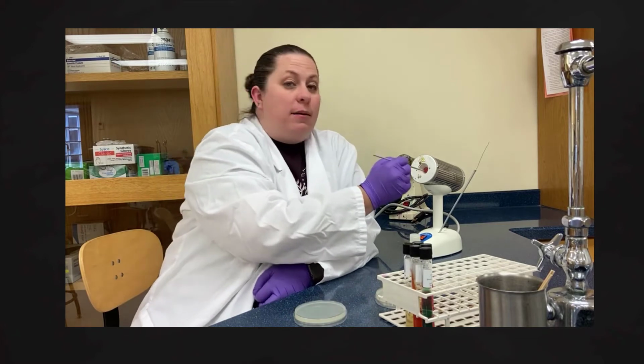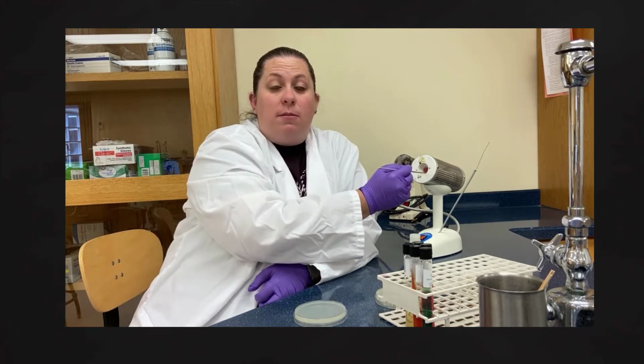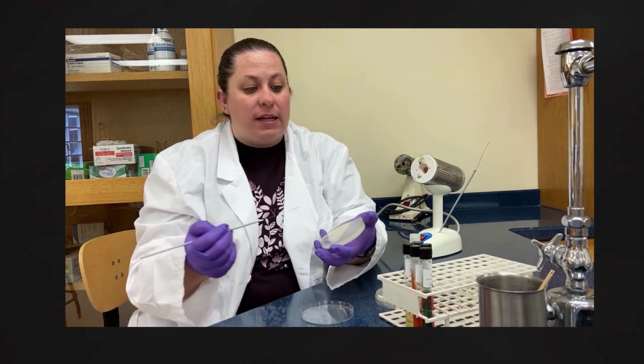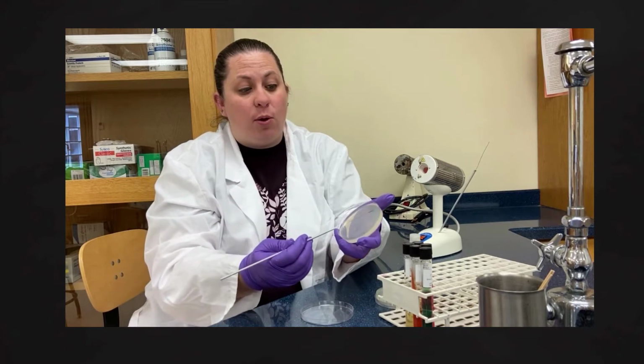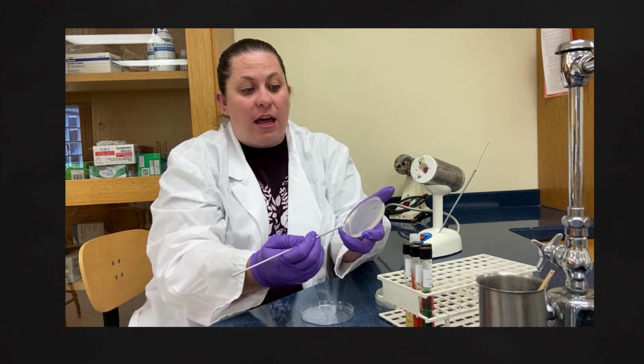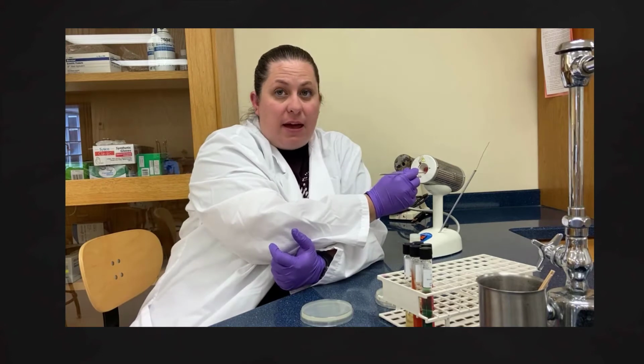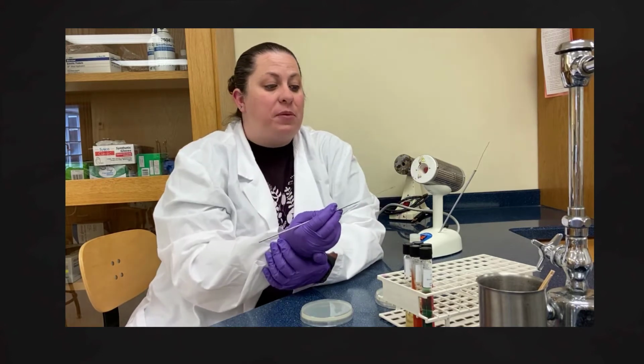Okay, now I'm going to sterilize my loop, because I want to pull some bacteria from the previous area, but I want to start limiting the amount of growth in order to make sure that we're going to get some single colonies. So again, I'm going to go by that zigzag area and pull from the edge of that, and zigzag back and forth down this way. And again, I'm going to sterilize my loop. So this is then quadrant 2.